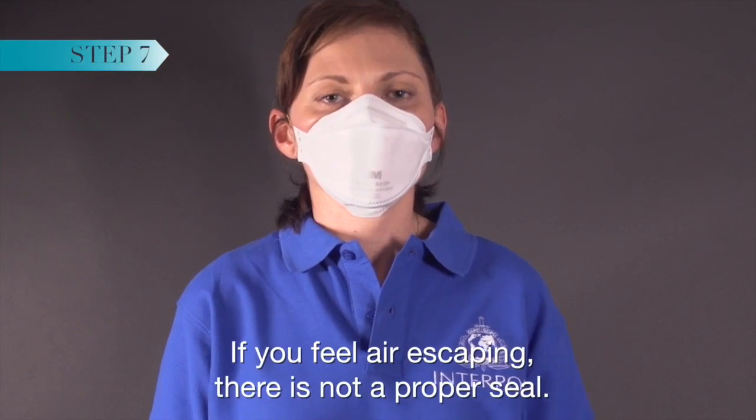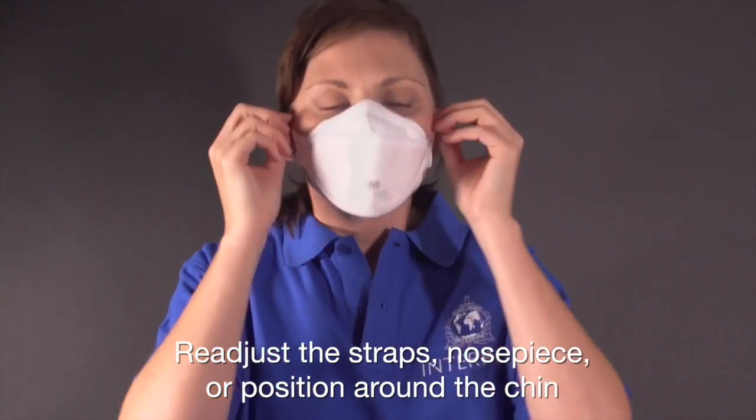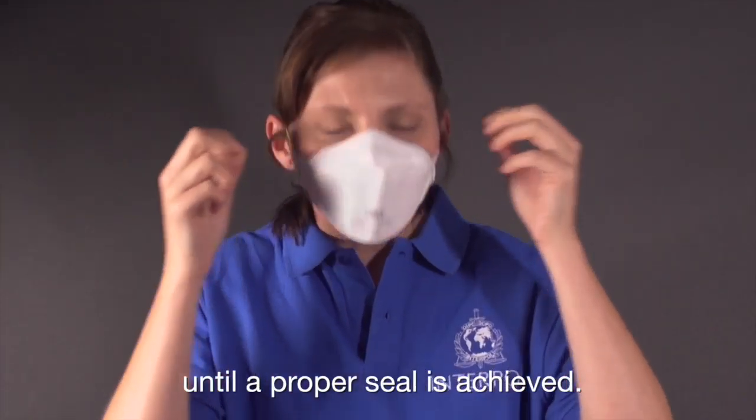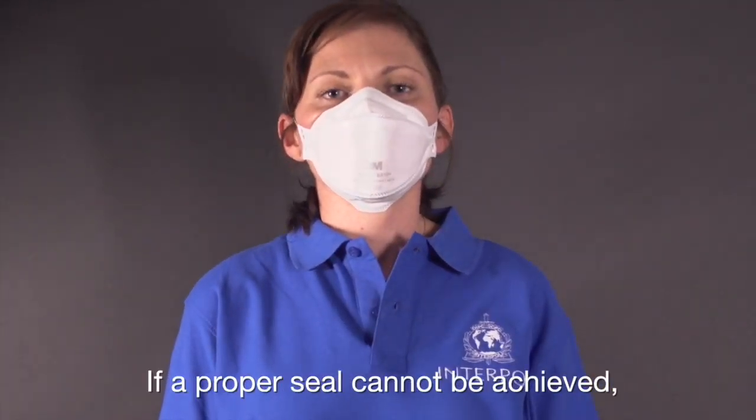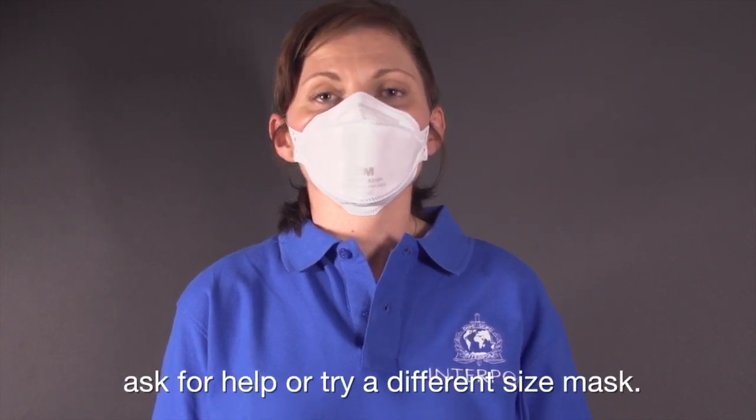If you feel air escaping, there is not a proper seal. Readjust the straps, nose piece, or position around the chin until a proper seal is achieved. If a proper seal cannot be achieved, ask for help or try a different sized mask.